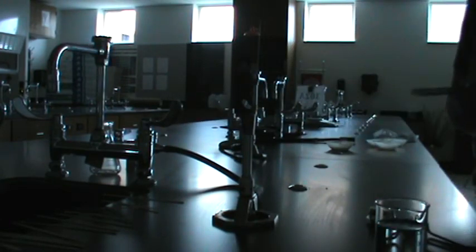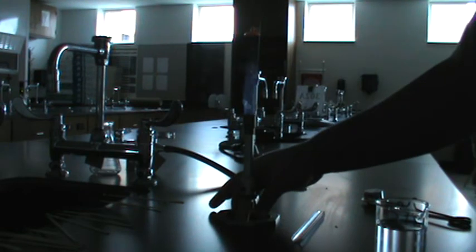Okay. Now, since some of the solid did fall down into the Bunsen burner, I want to clean that out so that we don't have any discrepancies on what colors you see. Because you kind of see how some of that was left over, and when we ignited it, we had that color come through. But when we use a Bunsen burner, we should get this nice blue flame. Blue is the hottest.